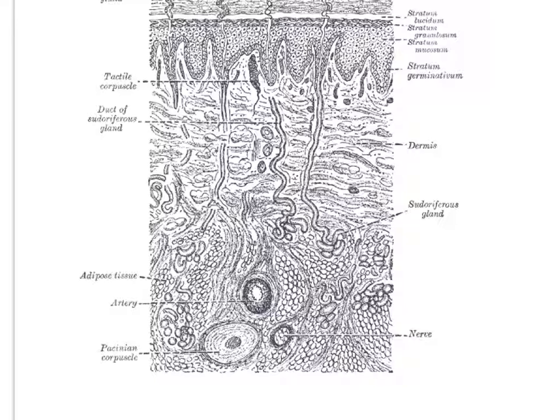Okay? Over towards the left of the slide now, you're starting to see better that sweat gland, toward the left on your slide. And now we're going to zoom in one more time, and I'm going to have you go look for those things. So kind of make out where they are. The Pacinian corpuscles, the bottom right. The sudoriferous, the sweat gland, is over there to the left, and the Meissner's corpuscles and the stratum lucidum are up toward the top. So let's zoom in one more to the blue magnification, which is 400 times normal.